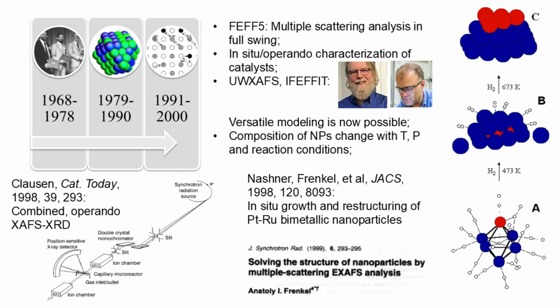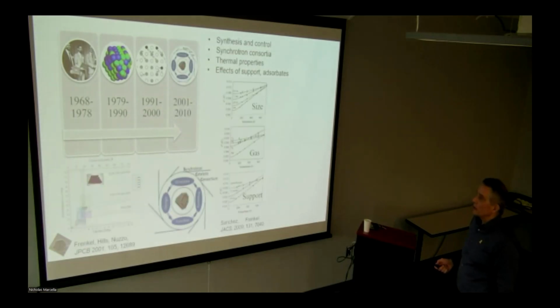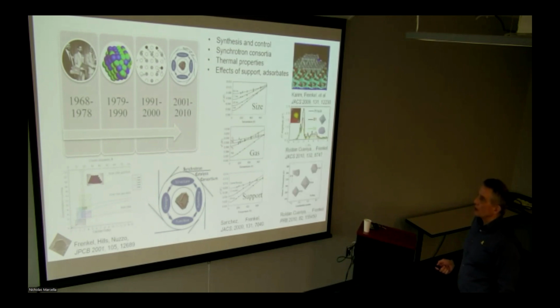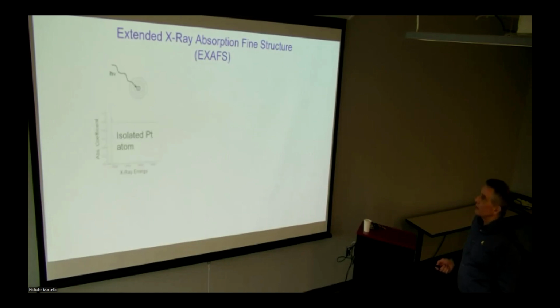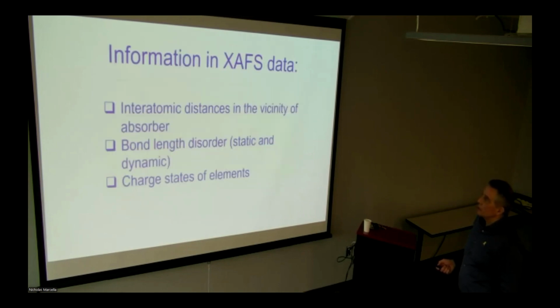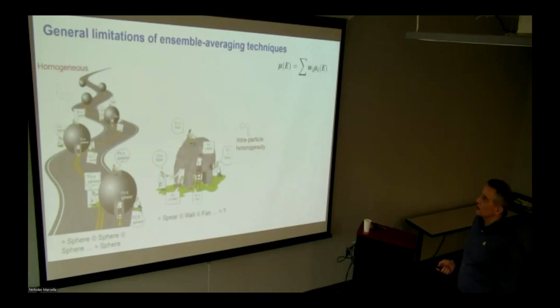So there is lots of know-how developed in 50 years in applying it in a clever way, using operando capabilities where not only do you measure the data, but you also watch the functionality, the activity of the material, to correlate structure and function. And many methods are developed for modeling and data analysis that you will learn in this series. And this I already explained.